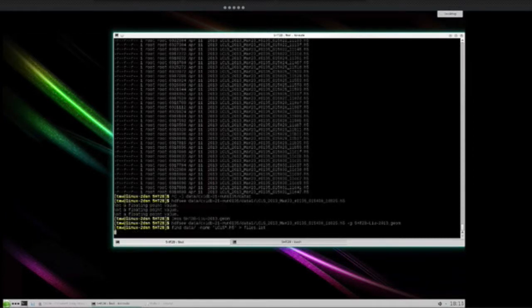Note the filtering here. I want all of the HDF5 files, or .h5 files, which begin with LCLS. There are some .h5 files in those folders that are not actually the main data files that we're interested in. That's the reason why that snippet is needed. Otherwise, it's just all of the HDF5 files in that folder. So those are now in a big list.